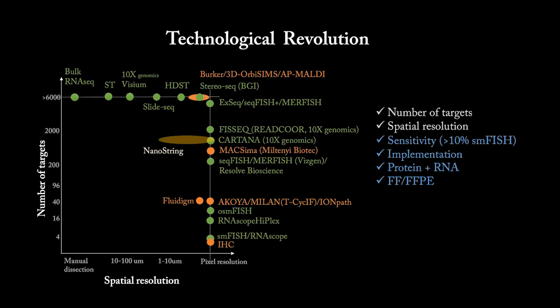And we also know that frozen tissue might help us to maintain the RNA quality. However, that will compromise the morphology of the cells and also limit the capability of the antibody to recognize the epitope. So if we want to combine protein staining on one section, normally FFPE samples will have higher performance to get a good immunostaining of the protein. So that depends on the question, whether we focus on the protein or the RNA detection in situ, then we choose the technology and the sample to apply to answer our particular questions.